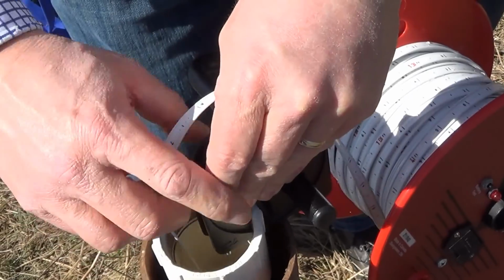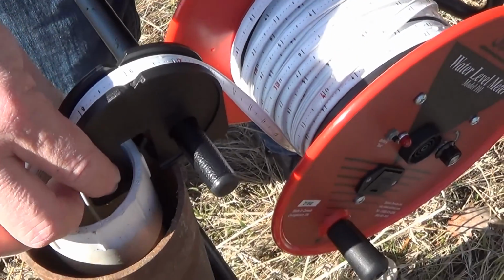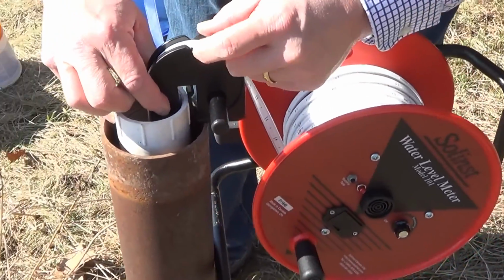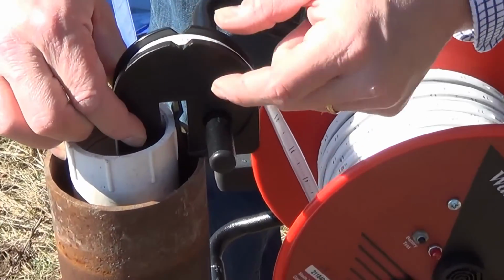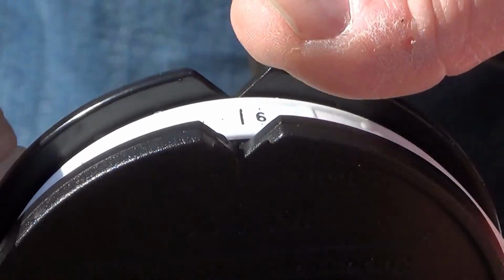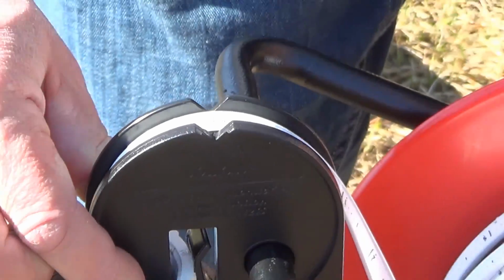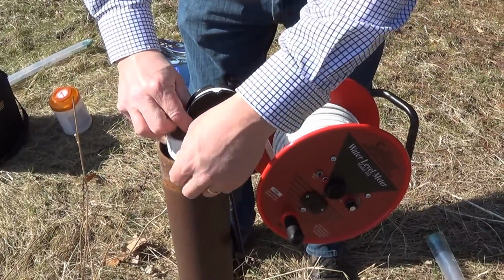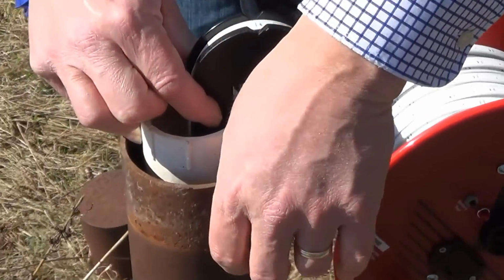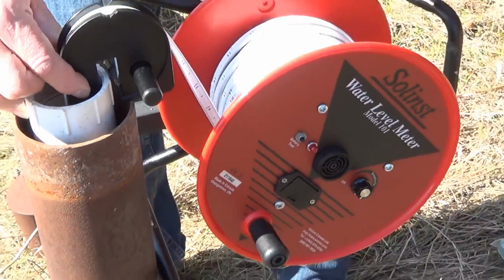Right over this little guide. And then that helps us hold this in place as we lower. And there are some actual measurements. You measure at this point and it tells you, for example, to add 0.2 feet because we're actually above the top of the well casing. But we won't need to use this. It's intended to prevent the tape from hitting this metal casing and damaging the tape. Okay, but I just wanted to show you that device.